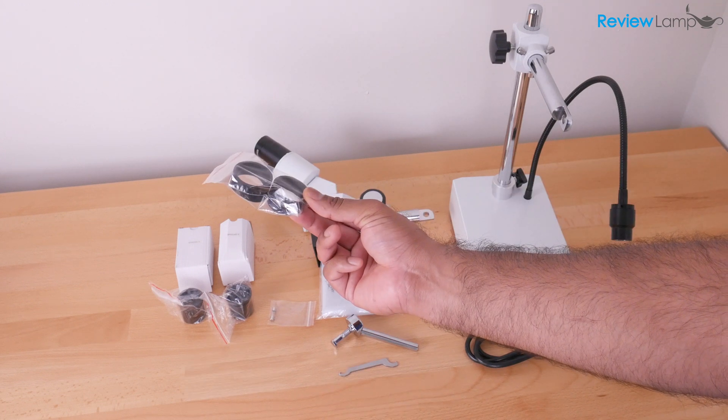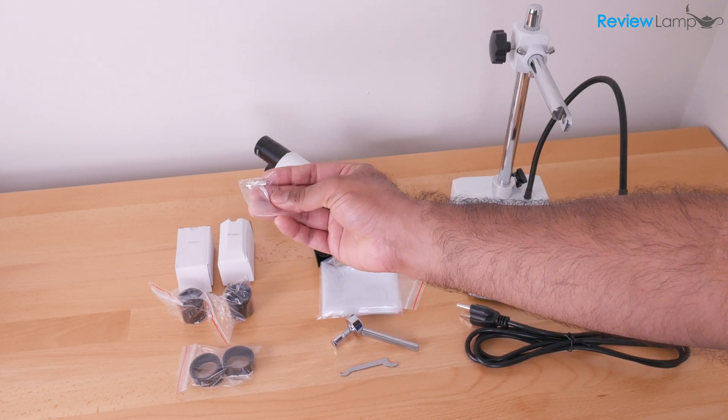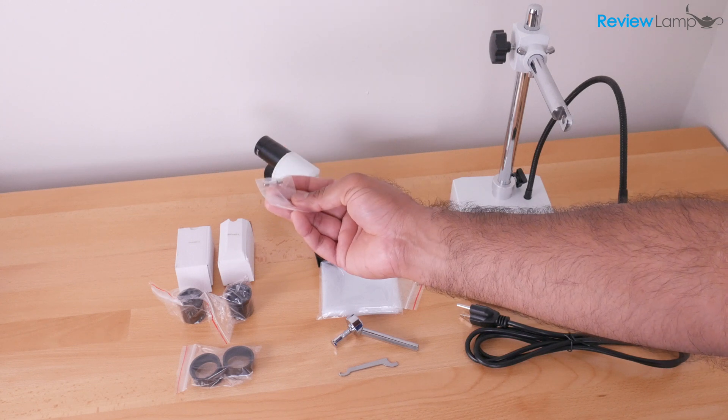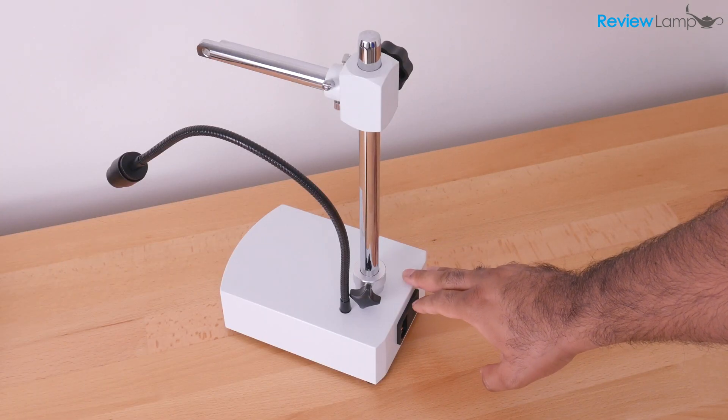It also comes with a set of eye cups. And last but not least, they also throw in an extra fuse for the LED unit.